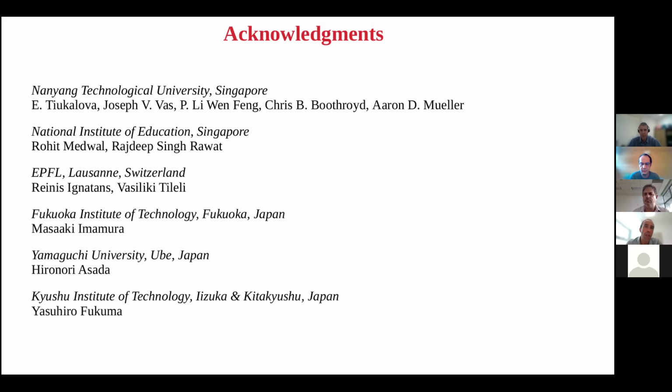So dislocations, we have tried before to apply the current. I mean, we do some basic characterization. So there were no dislocations, but in the BaTiO3 typically, so if we talk about the ferroelectric, the pinning sites are believed to be the oxygen vacancy sites. And to be able to image or to see more or less where the oxygen vacancy sites are, we need to go to really high magnification, or we need to use some spectroscopic technique.